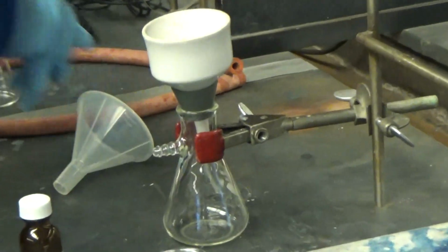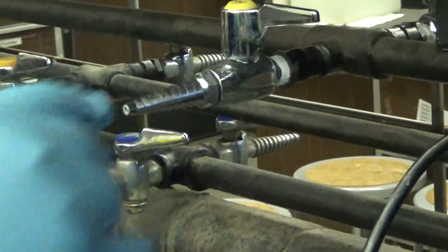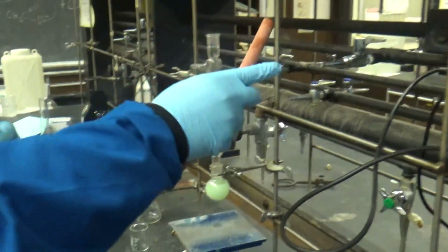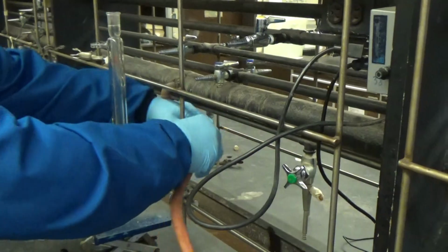The Büchner funnel. The hose. We always have to check if the vacuum is working. Use the yellow one for vacuum. Yeah, the yellow one, that's the vacuum. It's working very well. Sounds good.